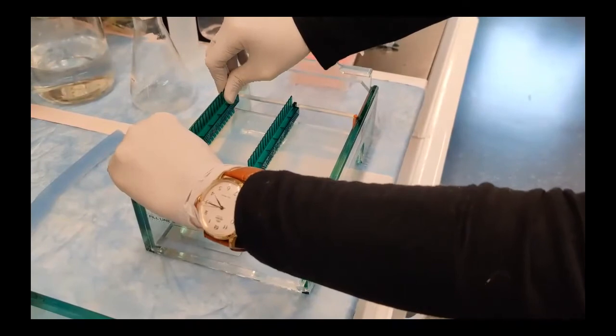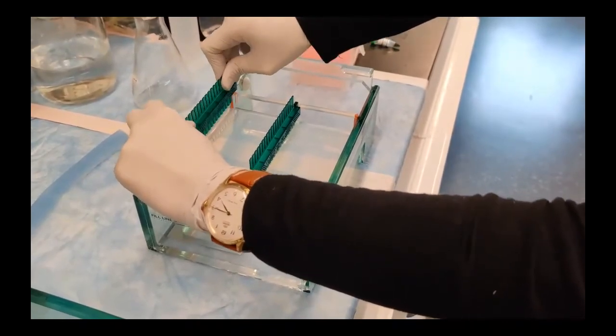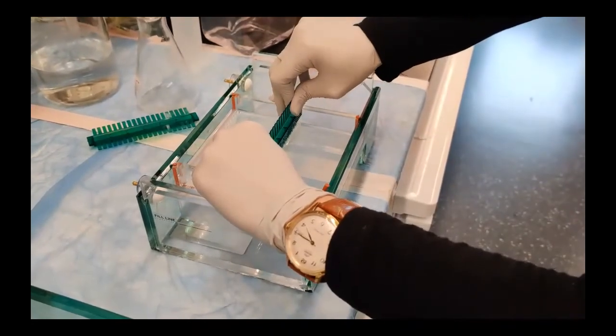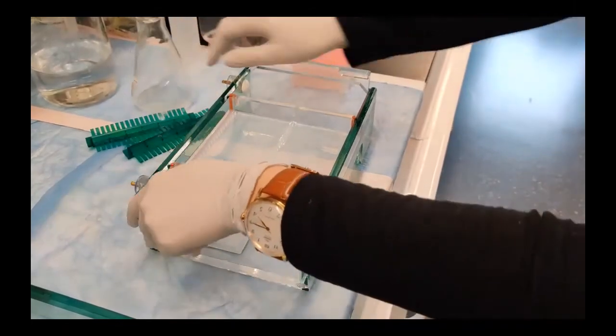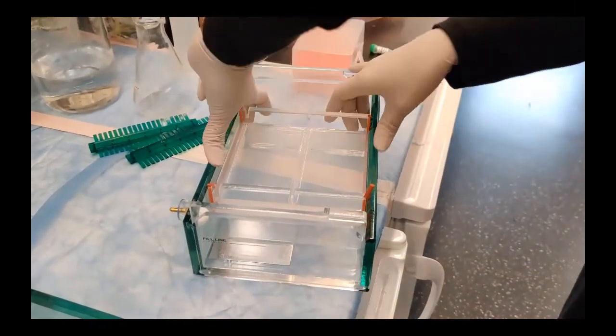After 15 to 20 minutes, the gel is now hardened and we can set it up for gel electrophoresis. First, we take out the combs that made the wells for us to add the samples.